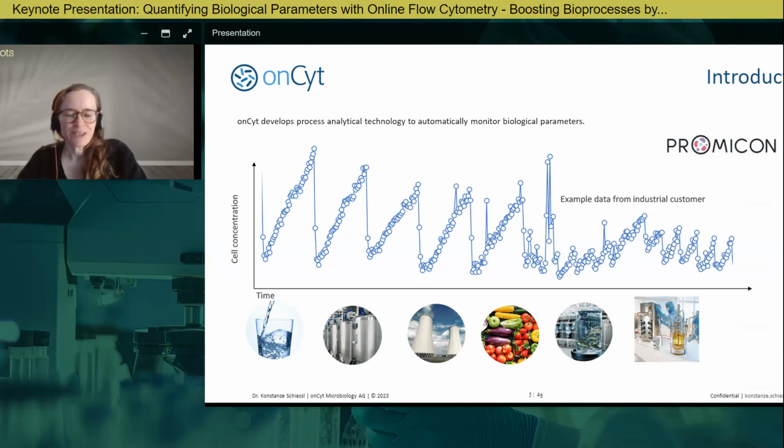Before I go into all of these many topics, I really briefly want to introduce my company, where I come from. So yeah, we are called onCyt, and what we do is we indeed develop process analytical technology using online flow cytometry, and we are focused on monitoring biological parameters. I want to mention that a lot of the data I showed today has also been funded by the EU in the Promicon project. And here in the middle, you see a data set.